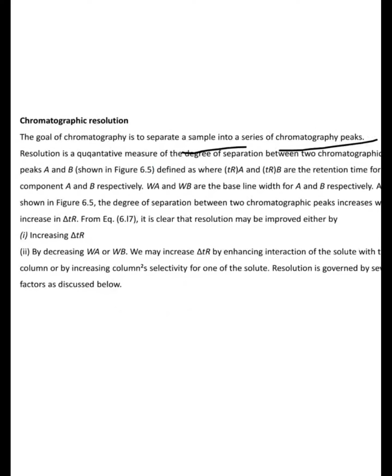So here the degree of separation between two chromatographic peaks increases with an increase in delta TR. When delta retention time is increased, the degree of separation also increases. It takes more time for separating the compounds as the solute passes through the chromatography, increasing delta TR.